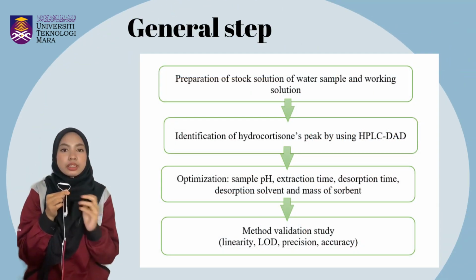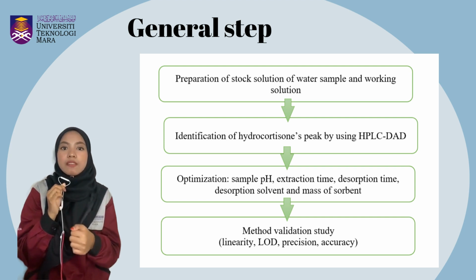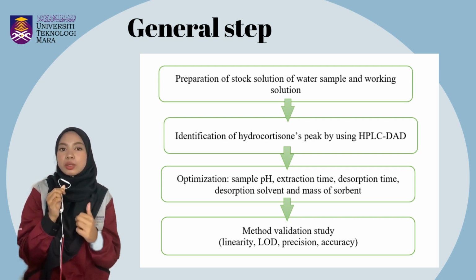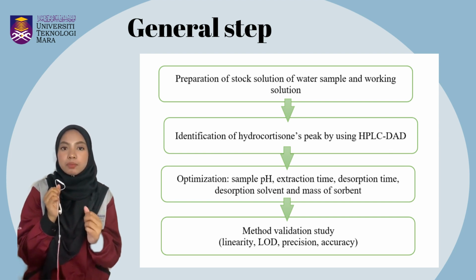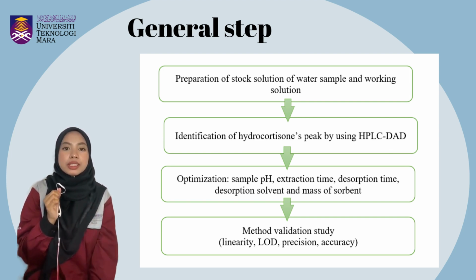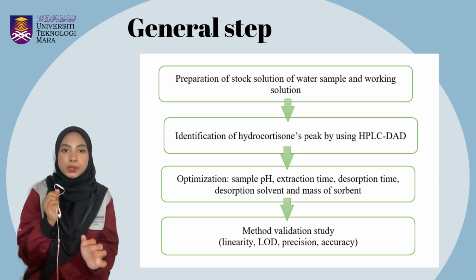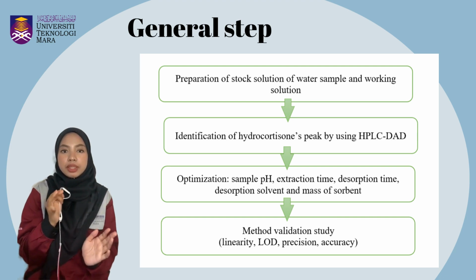This is the general flowchart of this study. First is preparation of stock solution and working solution. Next is identification of hydrocortisone peak using HPLC DAD. Then optimization of dispersive micro-solid phase extraction parameters. And lastly is method validation.